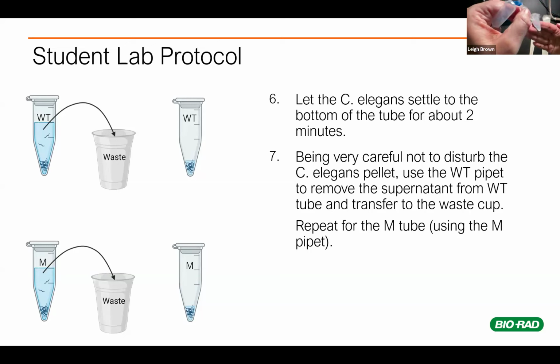And Damon, if you would clarify, should they disrupt the pellet while they're siphoning off the waste? Should they let it settle, or should they continue to progress and just take what's remaining of the pellet? You can just take what's remaining of the pellets. Like I said before, we're going to have so many worms at the end of this wash compared to the number that we actually need to put on the plate at the end, that if you're losing a portion of them due to a slightly unsettled pellet, it's going to be okay.